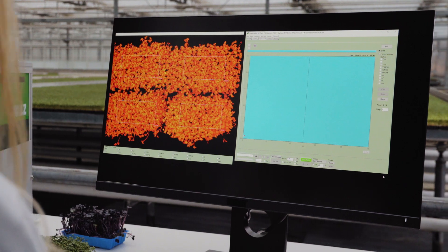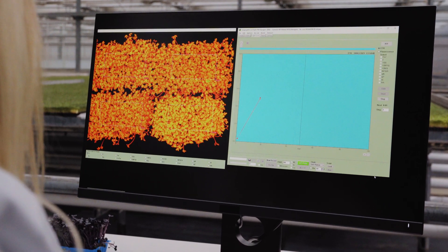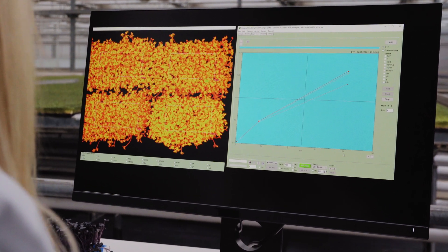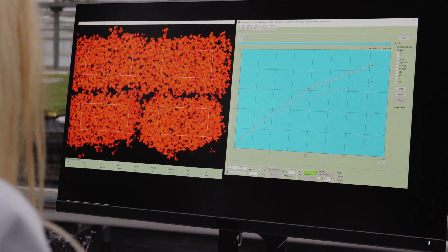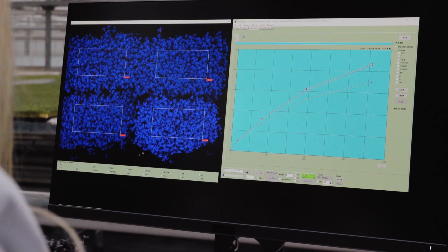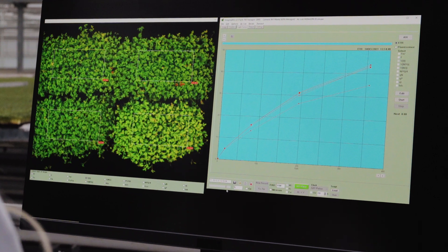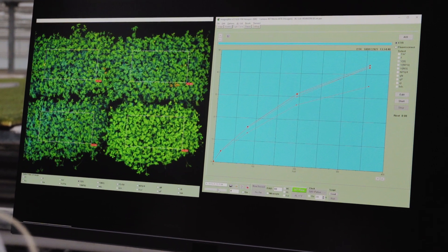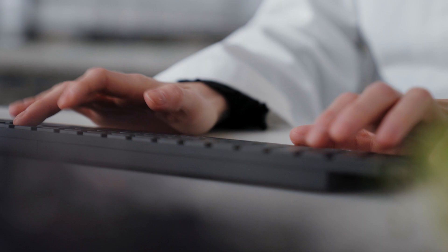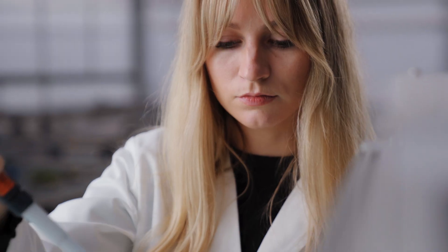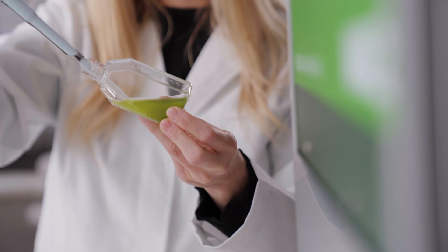The user-friendly software gives the operator full experimental control, but also allows beginners to make use of pre-programmed experiments. Photosynthesis parameters can be read directly and exported as numerical values or image data.